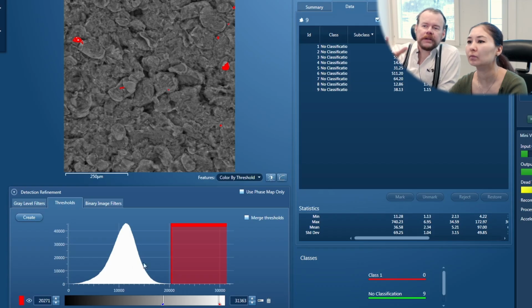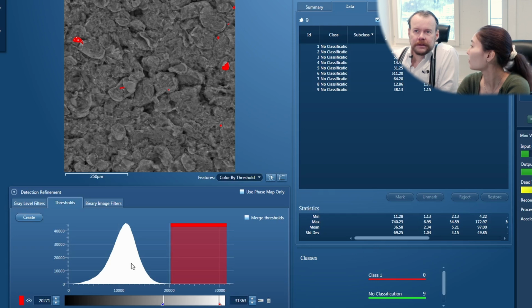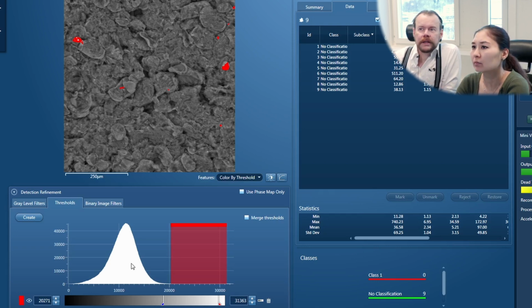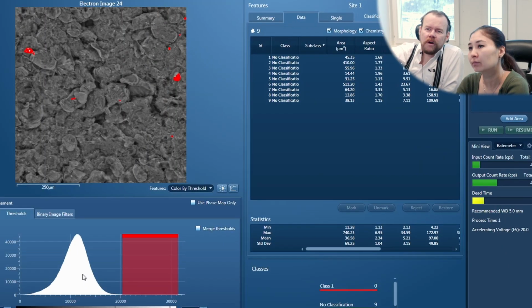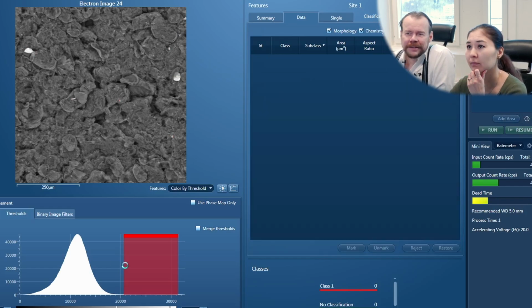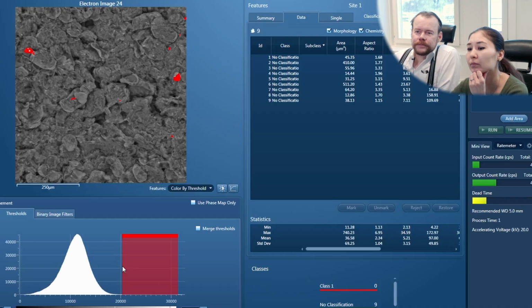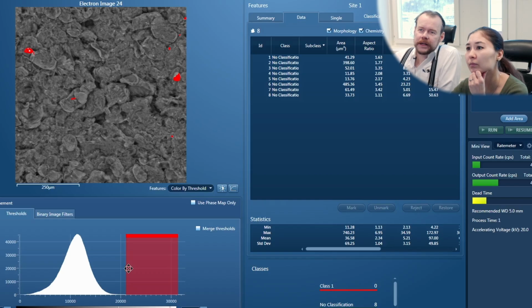Then you can adjust that so the ones that you're interested in are shown. Now we see it's about 9 particles there. So we can remove the smaller ones, so take it a little bit up. I just want to make it not take so long. So try to move it upwards until you have like 5 particles left. Yeah, something like this is fine.